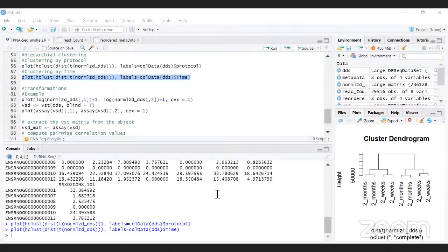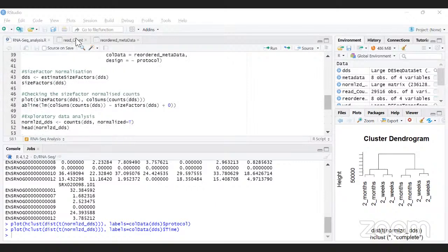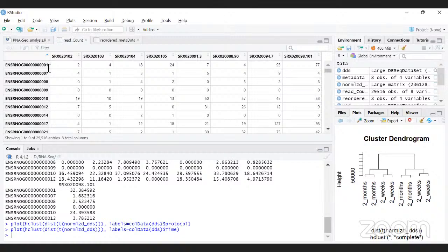He asked whether this table has genes or transcripts as rows. This particular table has genes, with respect to rats. These are not transcripts. But in case you're using transcripts, you would treat them in the same way. If there are transcripts, you would have ENSRNOT instead of ENSRNOG, and some number.